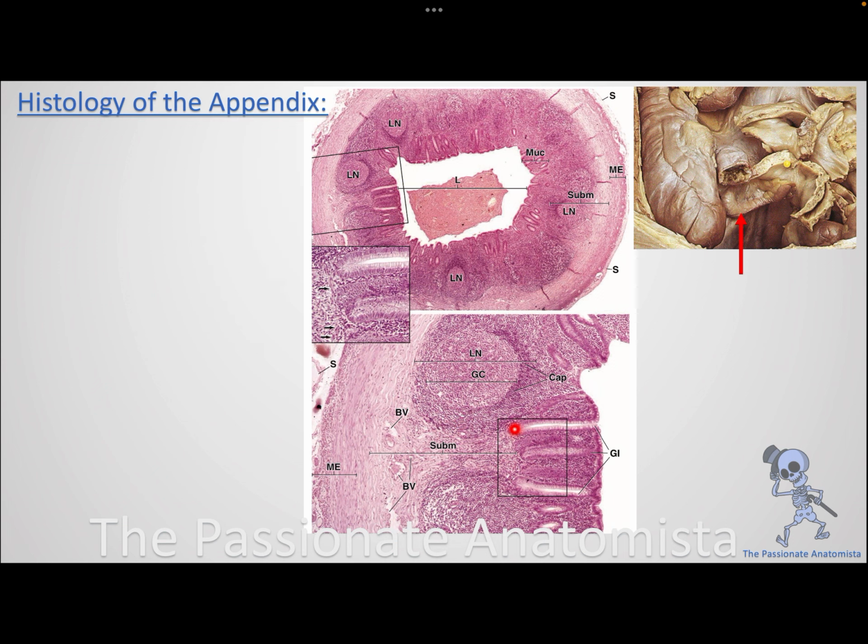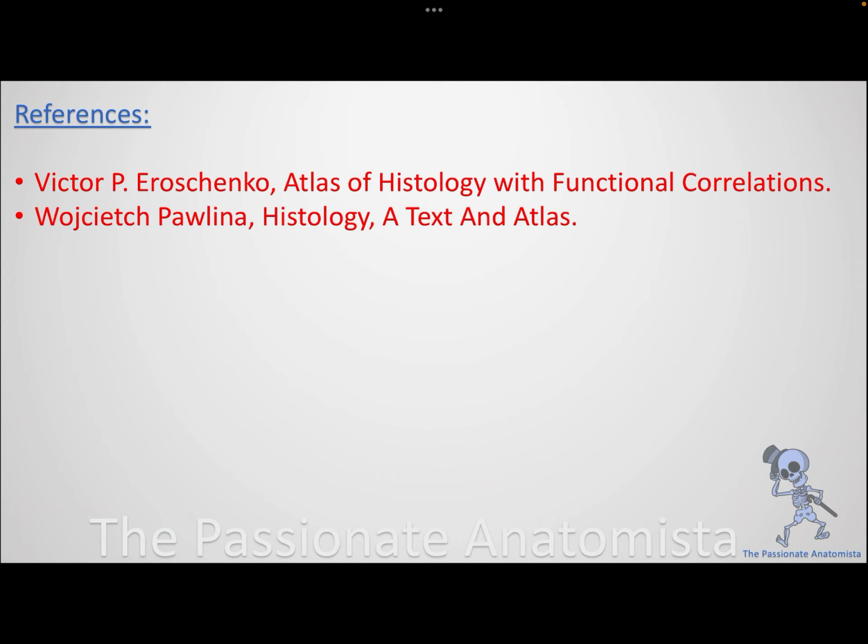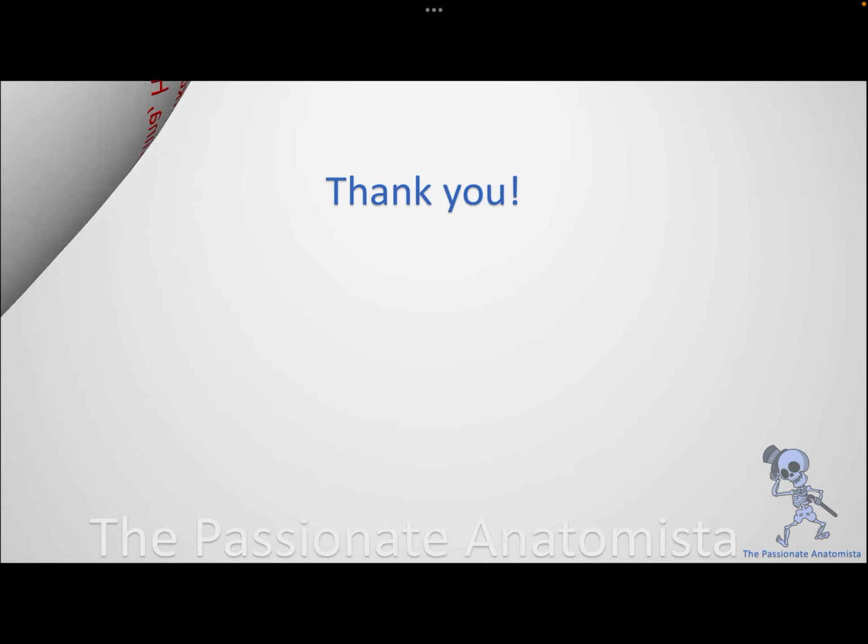All right. So it looks like the ileum, looks like the colon, and at the end, that's going to be the appendix. Okay, sharing the same epithelial lining of the large intestine and the same appearance of the lymphatic nodules in the ileum.